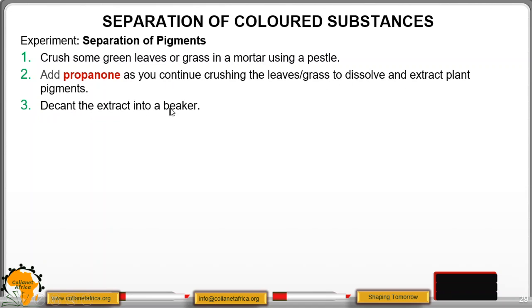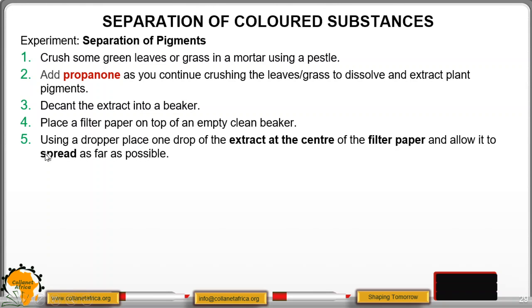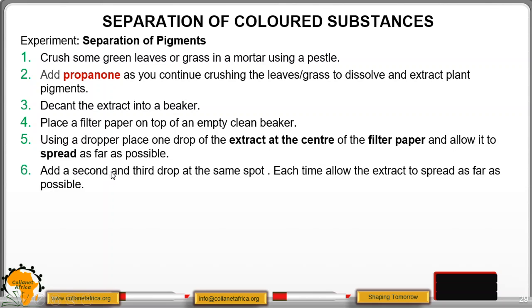Decant the extract into a beaker. Then, place a filter paper on top of an empty, clean beaker. Using a dropper, place one drop of the extract at the center of the filter paper and allow it to spread as far as possible. Add a second and a third drop at the same spot.